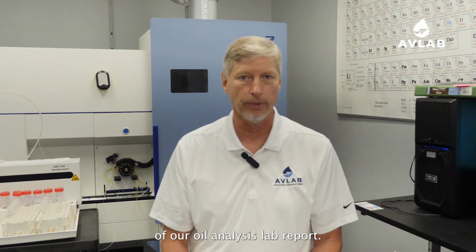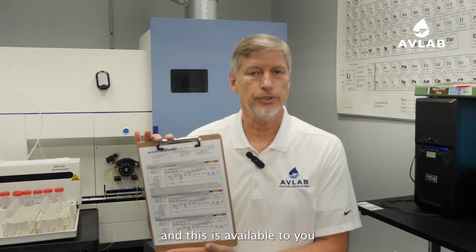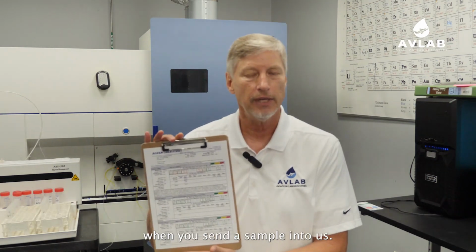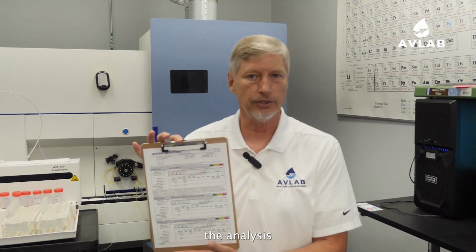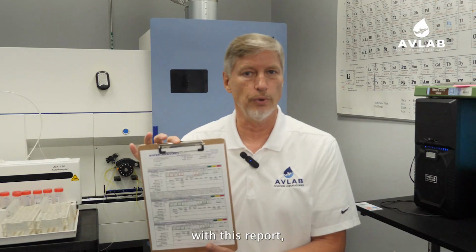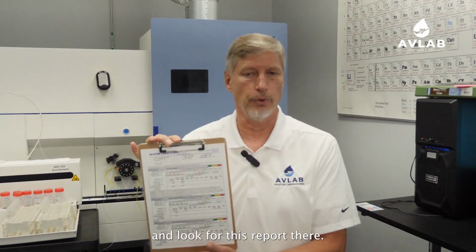Today I'd like to give a brief overview of our oil analysis lab report. The lab report looks something like this, and this is available to you when you send a sample into us. It's also available online. After we get the oil sample, we do the analysis, and we'll send you an email with a PDF file of this report attached, but you can also go online and look for this report there.